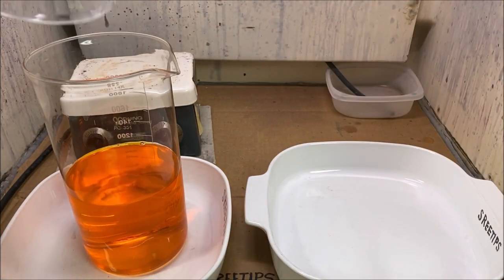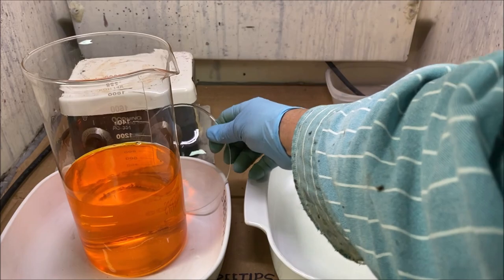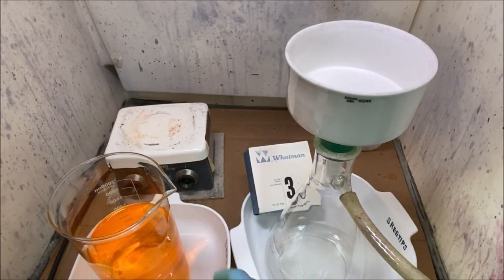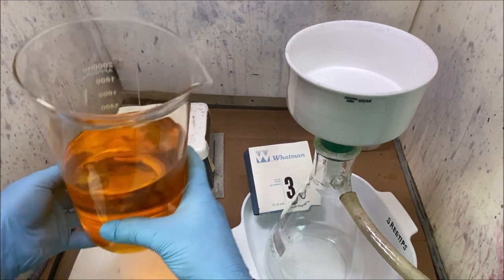and dilute the solution for the next step in the process. I'm adding some ice, cool it down, and dilute it down. All right, here we go. We're gonna filter our solution.